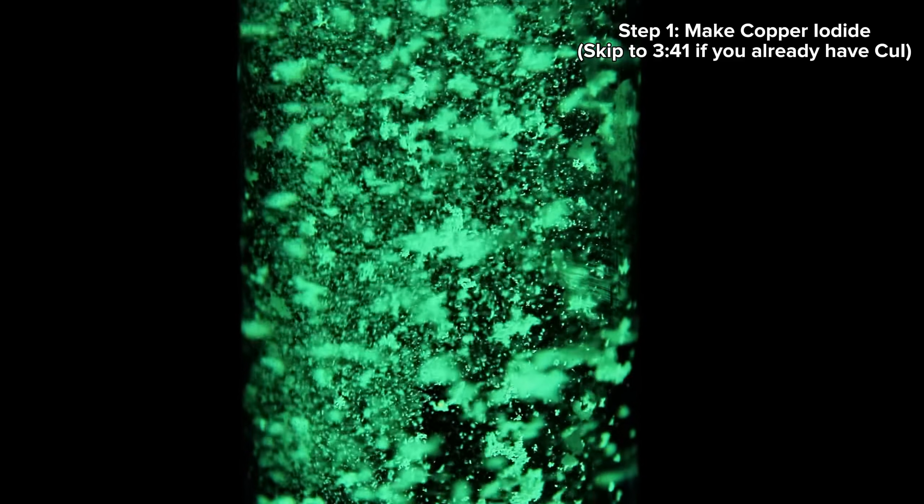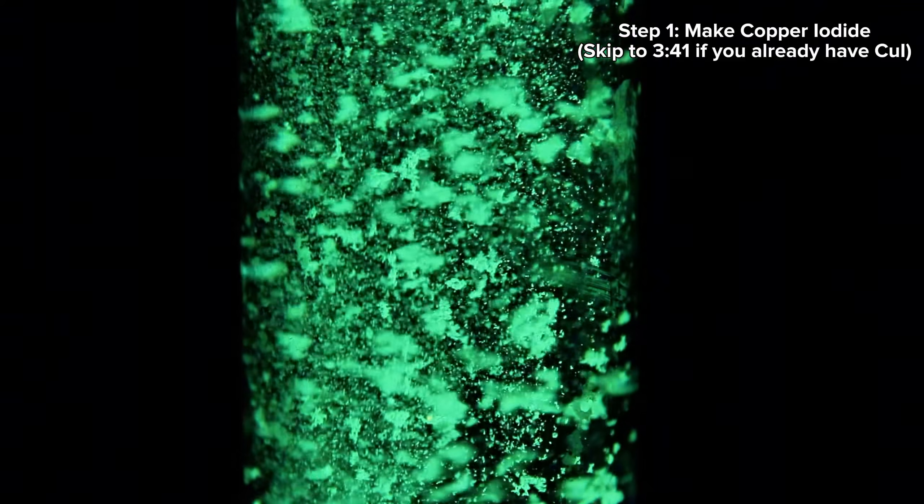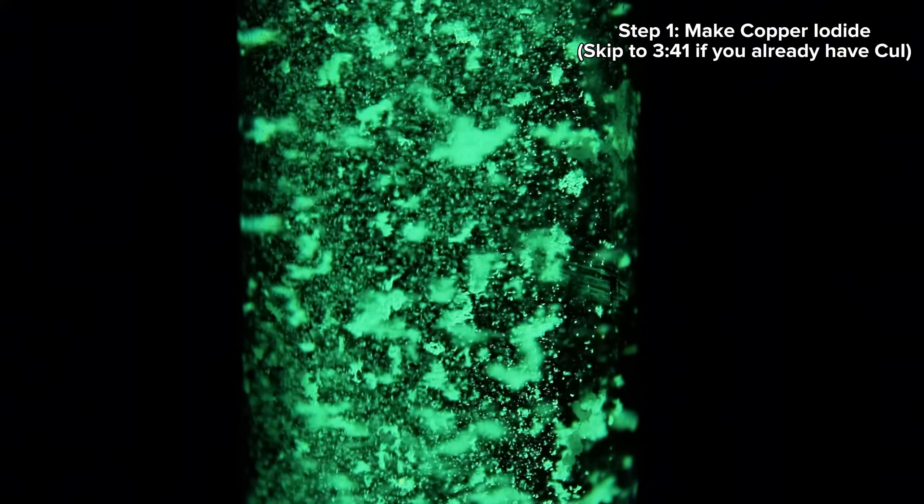Making this chemical requires the fairly uncommon copper iodide, along with pyridine which I made in last week's video if you'd like to give that a look first. Considering that copper iodide is something of a specialty reagent that most people don't have lying around, I'll be making that first. But if you do happen to already have some, feel free to skip to the time shown on screen.